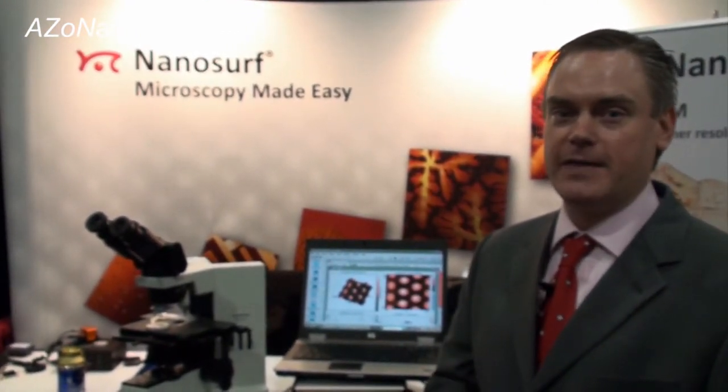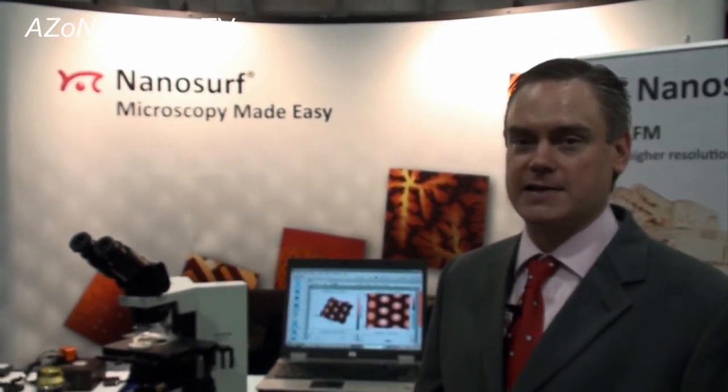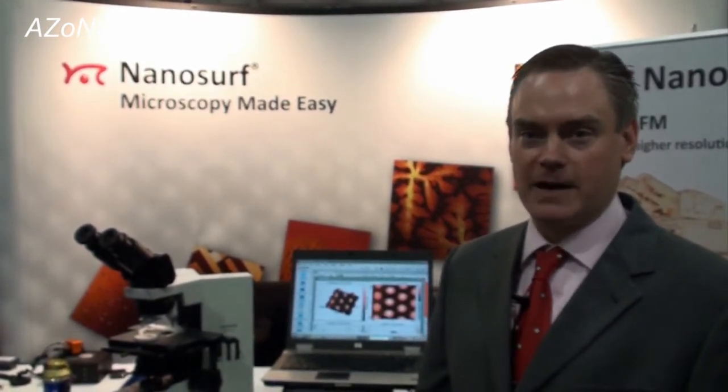Today I'd like to introduce Nanosurf's new Lens AFM. This is a system developed by Nanosurf recently that is designed to stay in line with Nanosurf's tradition of ease of use, affordability, and modularity. This system is targeted towards people that are currently using optical techniques, optical microscopes, or optical profilers, where they might want to combine AFM capability with those systems. The Lens AFM is configured so that it easily integrates with a standard upright microscope or many commercial optical profilers that are available.